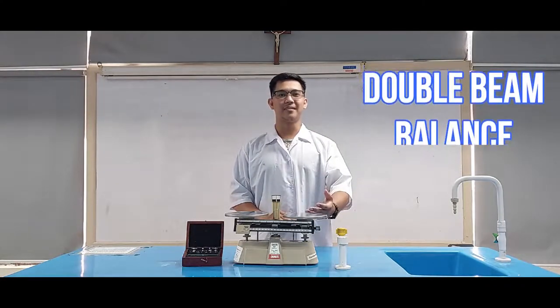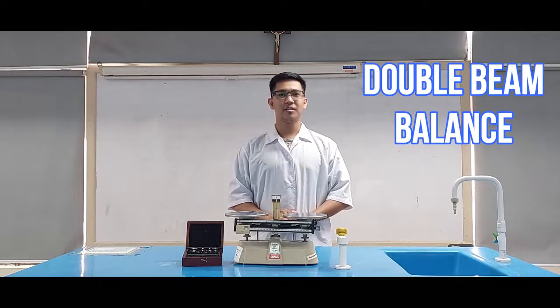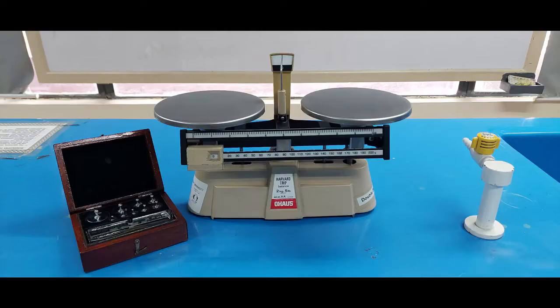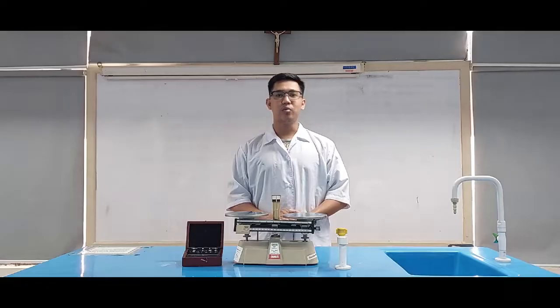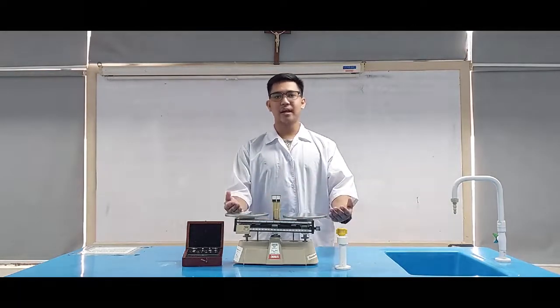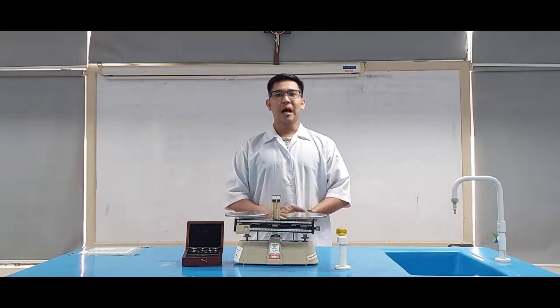The Double Bin Balance. To use this kind of scale, just like the single bin balance, place the object you intend to weigh on one of the pans. Then place items of known weights such as standard weights on the other. When the two pans are as balanced as you can get them, the weight of the unknown object is equal to the sum of the standard weights.